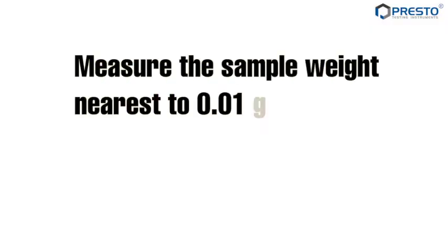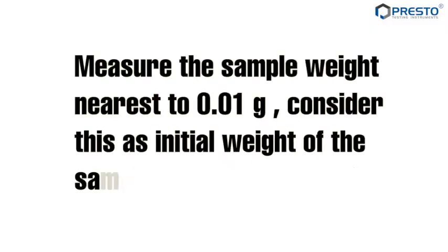Measure the sample weight to the nearest 0.01 grams and consider this as the initial weight of the sample.